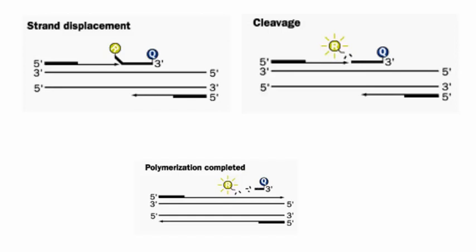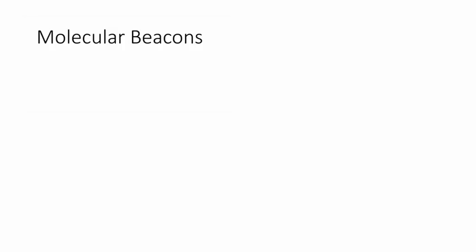And then, of course, at the next round of amplification, you have 2 copies of DNA, and each one again will separate, just like you see here, and each one will have a primer bind to them, and this whole cycle will begin again. So some of it is still chewed up, but you have others that are still intact. And you can have quite a bit that's still intact. So as each round of replication completes itself, you're going to have more and more reporter separated from quencher, so you're going to have higher and higher levels of fluorescent activity.